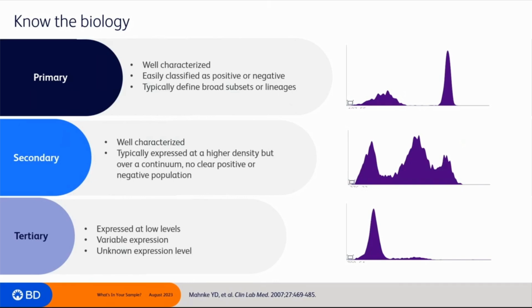So let's talk about CD58. CD58 expression changes in hematogones and B lymphoblastic cells. Basically, it changes in a normal condition and in the disease state. Hematogones, or normal immature B cells, express moderate CD58, whereas B lymphoblastic cells often express bright CD58.